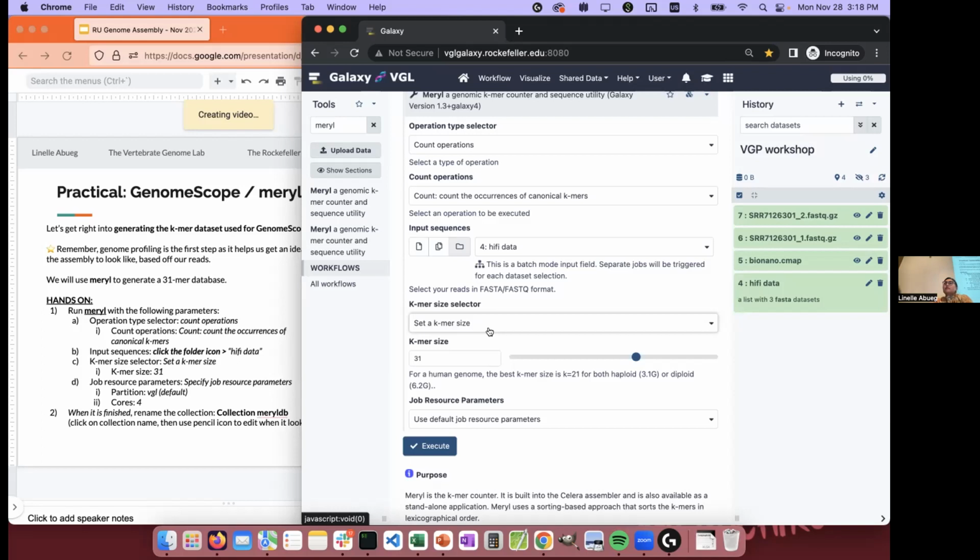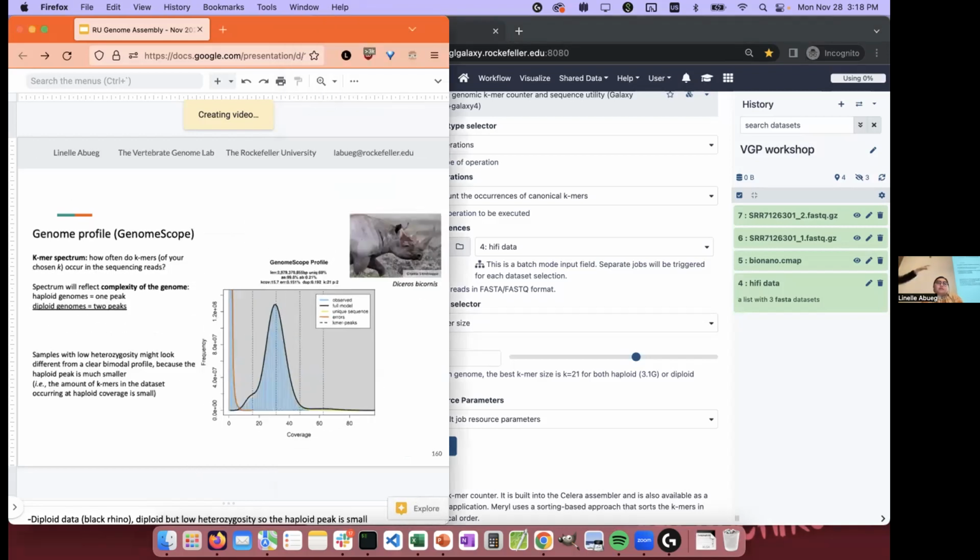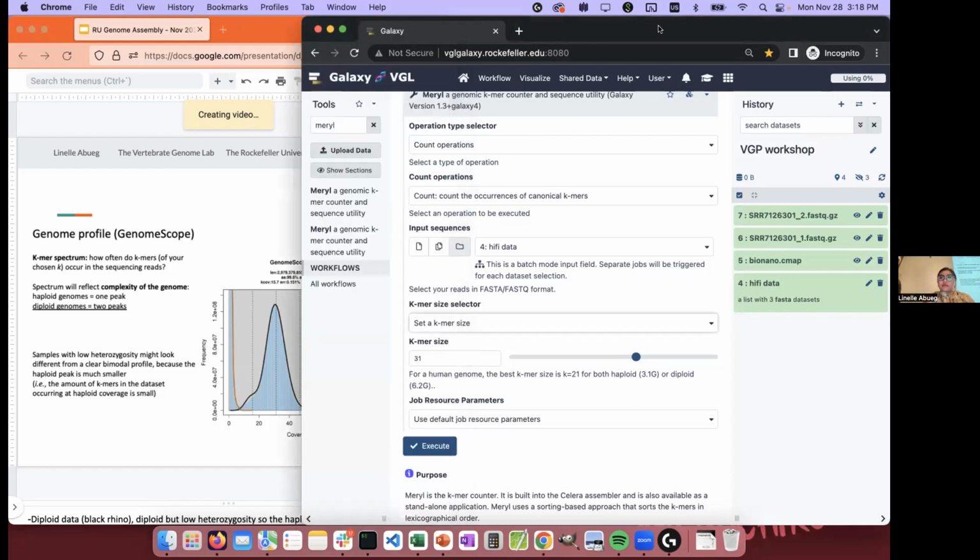If you remember, the way the distribution looks is a sort of balance between the first spike, not the very beginning, at around 0, this one, and the others. And depending again on the quality of the sequencing data, it will affect how much you can. Basically, it's been shown that between 21 and 31 is good for this kind of analysis when you have either hi-fi or Illumina reads that have a comparable quality score.